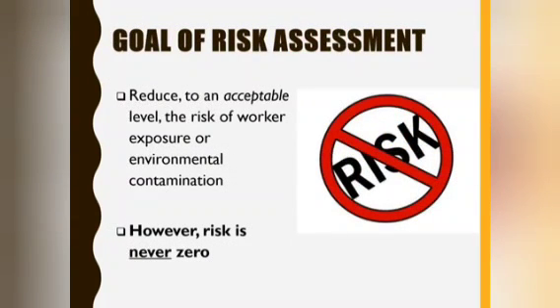The goal of risk assessment: reduce to an acceptable level the risk of worker exposure or environmental contamination. This is the ultimate goal of using the risk assessment process. You are trying to reduce the potential for laboratory-acquired infections. You must, however, understand that the risk cannot be reduced to zero. There is risk in everything that we do while working in a laboratory.